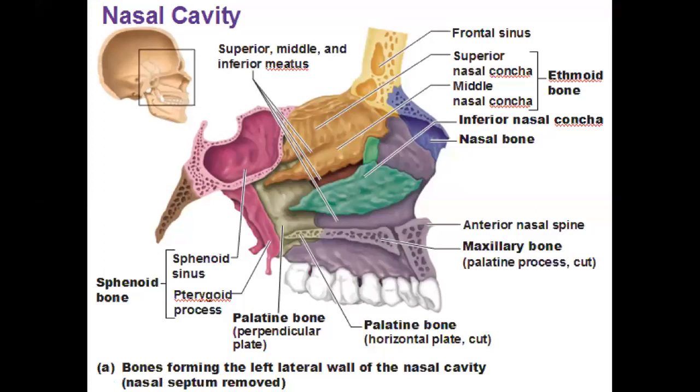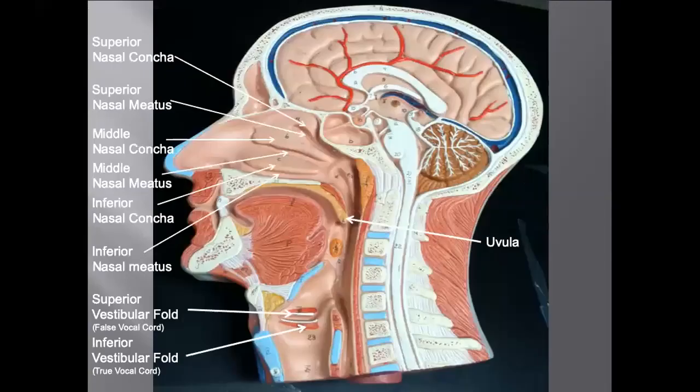Now, I've seen these before in anatomy too, with your superior, middle, and inferior nasal conchae, also called the turbinates. Either way, but let's see, get past that. This is how you'll be tested on this. You have the half head model. So each one of the raised ridges is the conchae. The ridges in between, those are the superior, middle, inferior nasal meatus.